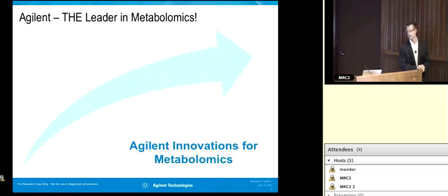There are certain assumptions that we have to make about this algorithmically, and so it's really difficult to develop the software for an open platform. Because there's certain things that we know about our mass spectrometers, and we can obviously test thoroughly with our instruments. So it is not going to support GCMS at the first release. That is in the works. It's something we're very interested in doing, but it will not at this time do anything except LC-TOF and LC-Q-TOF.